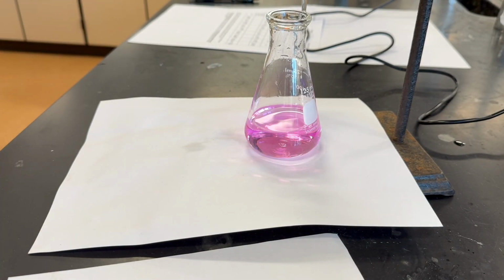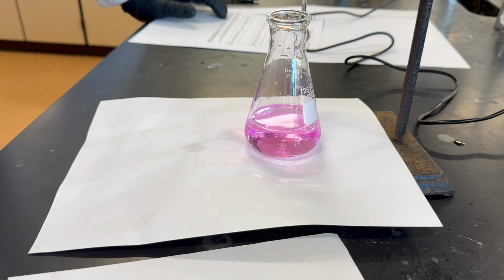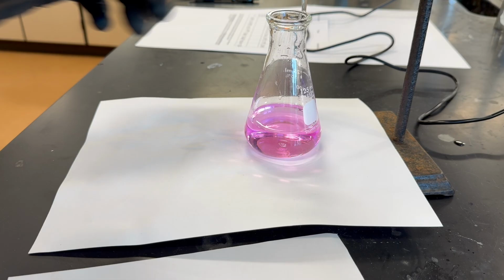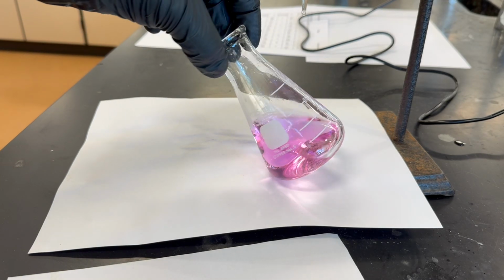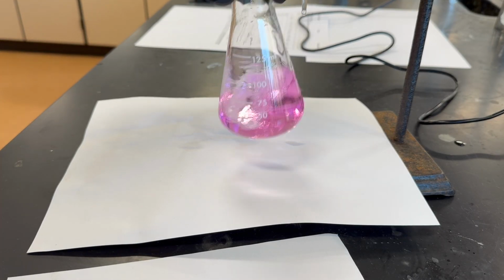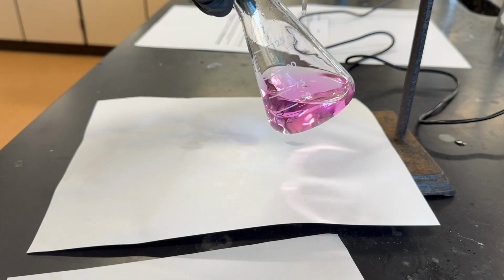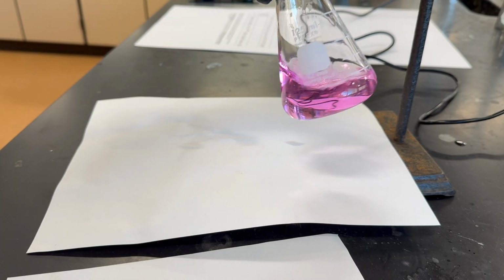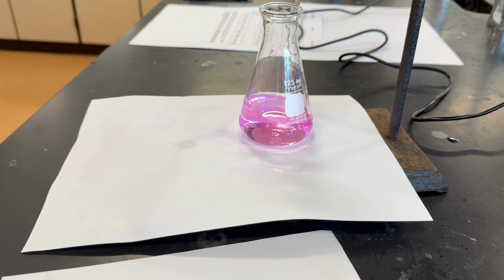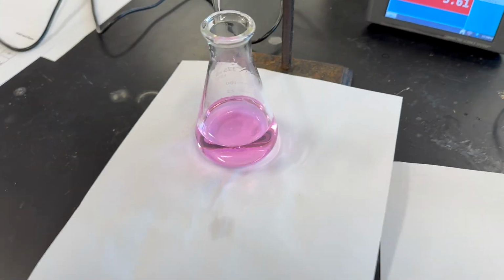And we're going to look at our milliliters of base added. Again, 21. This one is at 21.10. So we have 21.0 and 21.10. Let's do some calculations.